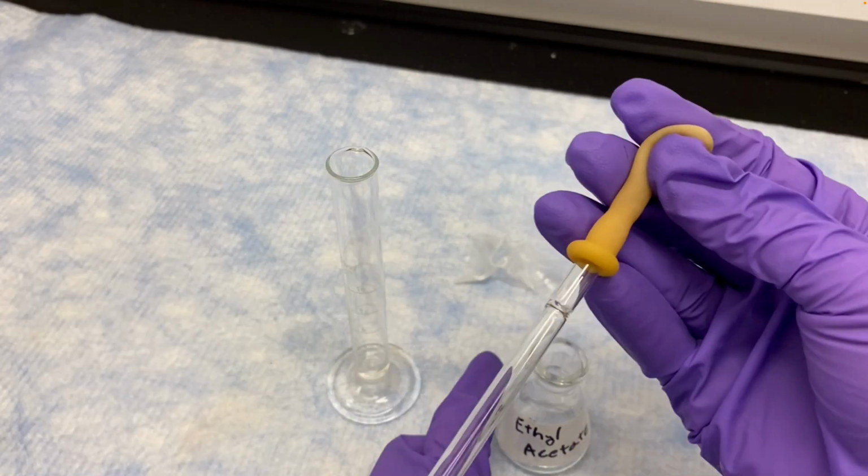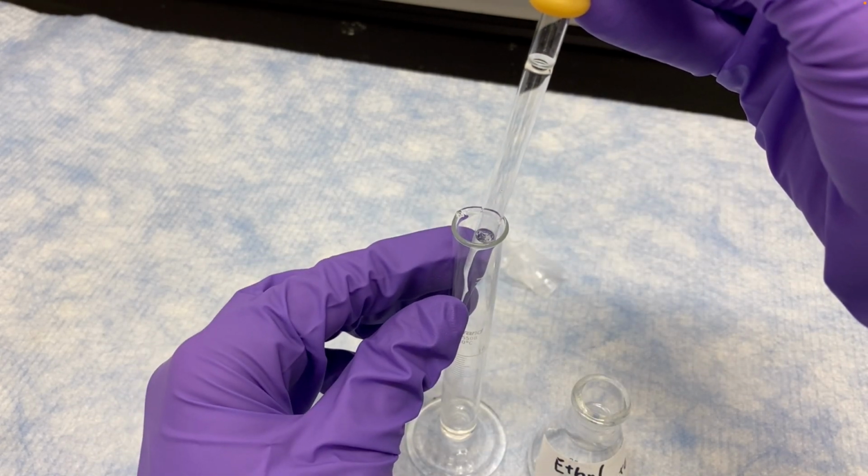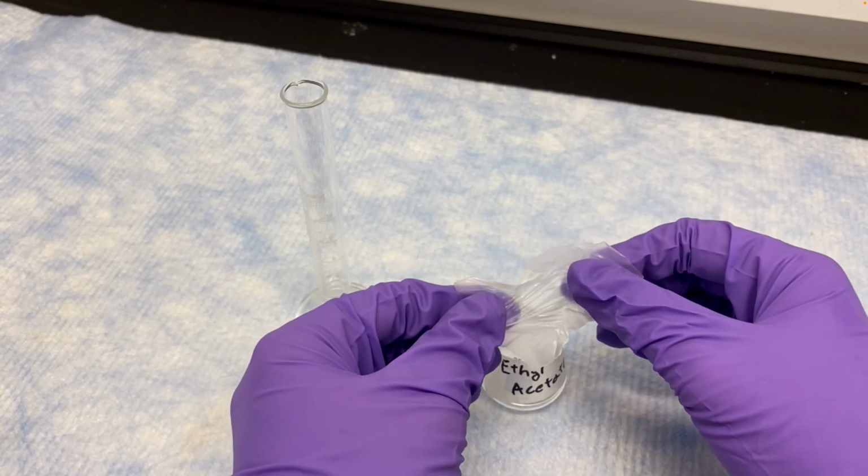When you measure the amount of liquid in the graduated cylinder, though, you want to make sure that the cylinder is standing on a level surface. So you don't want to hold that in the air when you check the volume of the liquid in the graduated cylinder. You want to leave it on a flat surface. You want to get eye level with the top of the liquid. When you do that, you'll notice that the liquid is not a straight line, but it sort of bows into a U. That's called a meniscus, and when you read the volume of liquid, you want to read it based on the bottom of the U, or the bottom of the meniscus.